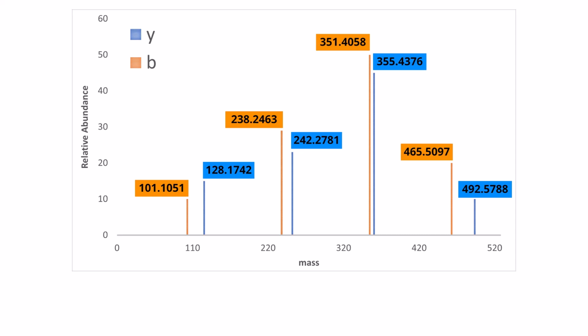Extra background noise was removed from the graph to focus on the main peaks. Each peak represents a peptide fragment, where each peak is characterized by MZ and intensity values. In real MZ graphs, we have mass to charge ratio, which is MZ. For simplicity, we converted the MZ to mass to simplify the calculations.